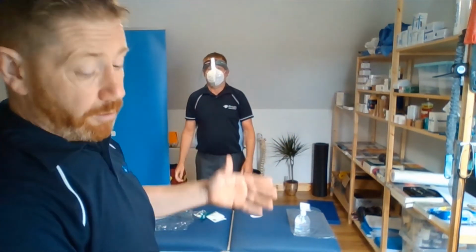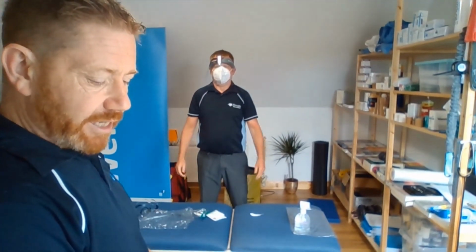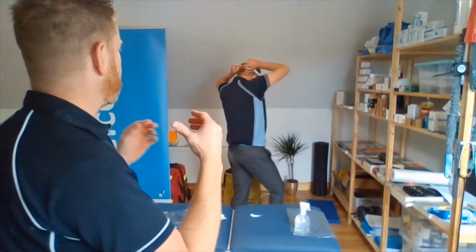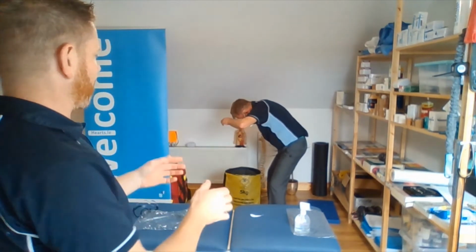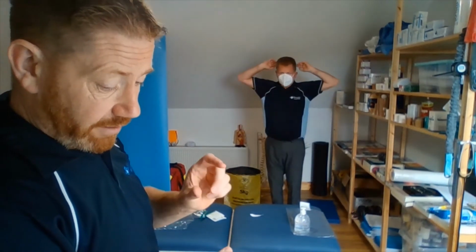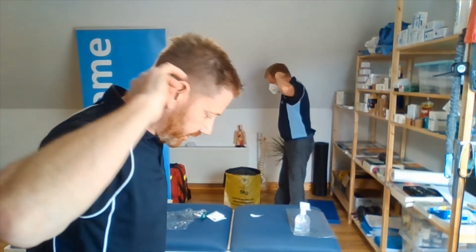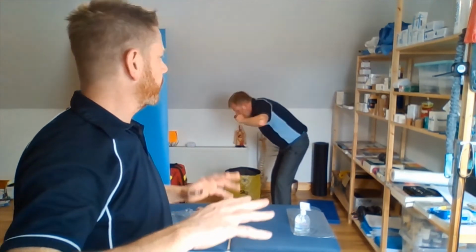Again, the proper type of bin is required, or bag I should say. The next thing he's going to go for is eye protection, where he's never going to handle directly under the mask. It's going to be the outside only. He's standing over the bin, handling there, and it's going directly in, so there's no contact. The mask on his face is also going to be removed like this, so there's no contact directly near the front of the face, eyes, nose or mouth.